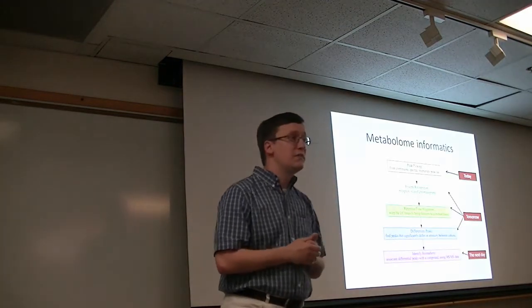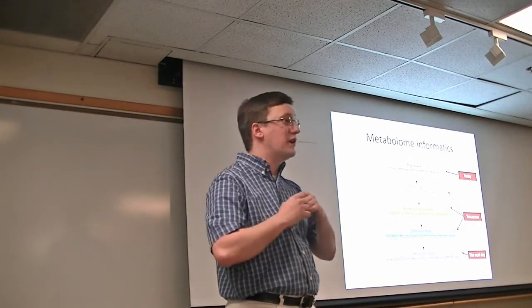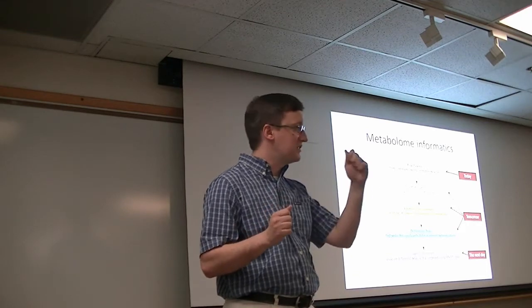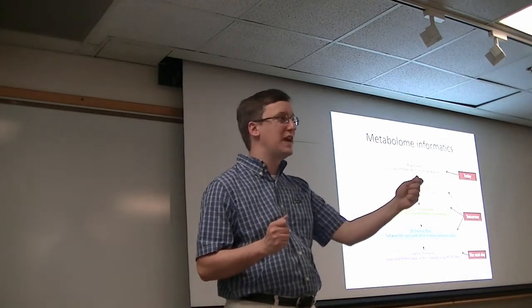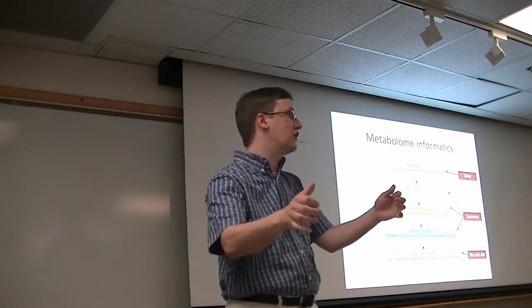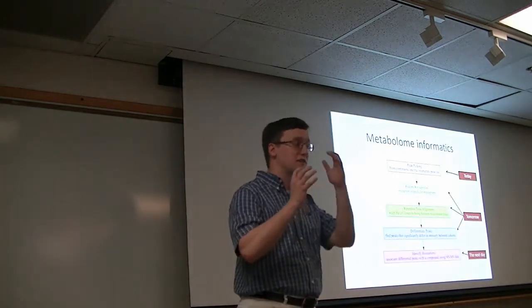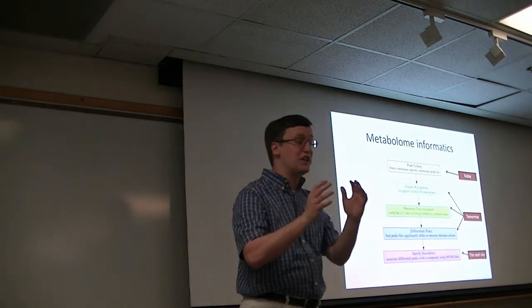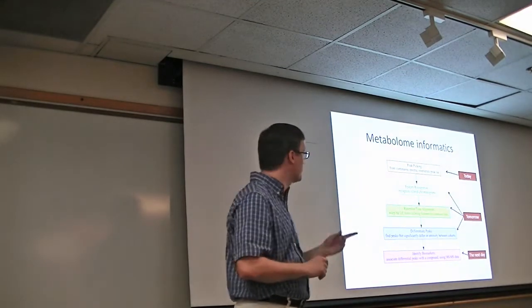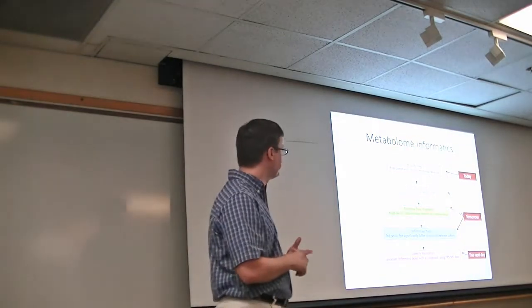All right. From there, we have the problems of retention time alignment. So maybe you've run many replicates of the same experiment, and now you want to determine whether this feature, which was seen in replicate A1, was seen in A2 or in A3? Or was it found in the other cohort in B1 and B2 and B3? So this ability to recognize that drifts in retention time may have occurred due to the chromatography of the experiment is rather important. And this is one of the features that we'll be addressing tomorrow when we talk about XCMS.